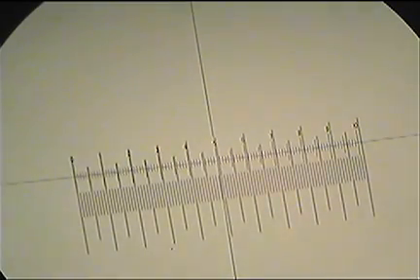On the stage micrometer, what distance do we have there? Well, looking at that, we've got 9 of our larger units, so those are 0.1 each, so we've got 0.9. Then I've got another 5 of the little units to the slightly shorter line, which would be 0.95.